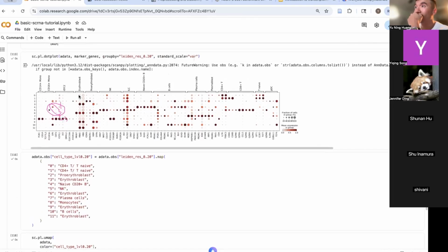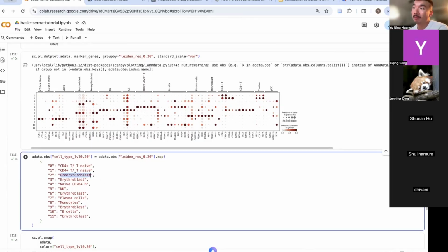It's number two. So yeah, this is the gene expression. It also makes sense because it's not a clean cluster here. They showed a lot of different cells' marker gene expression. So I would say maybe this one I won't name as pro-erythroblast. Maybe I would name them as some sort of unknown, because I think pro-erythroblast might confuse Dr. Louis.